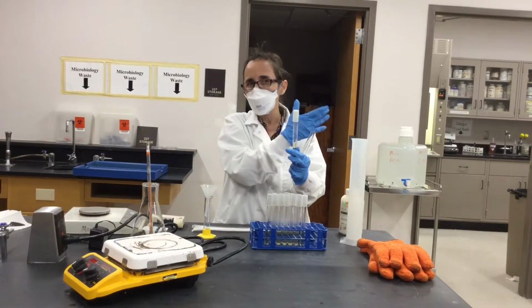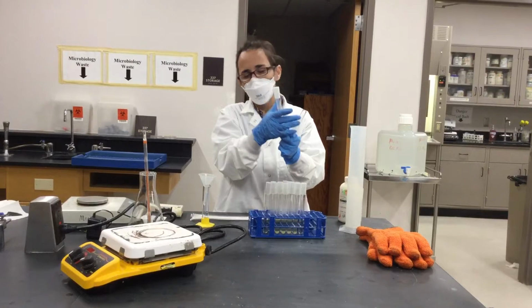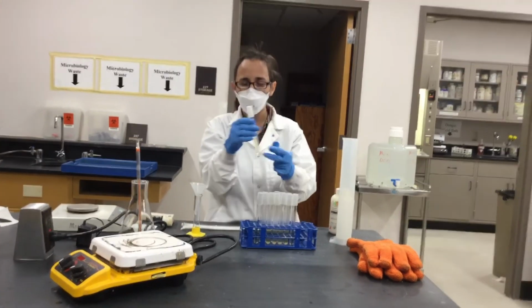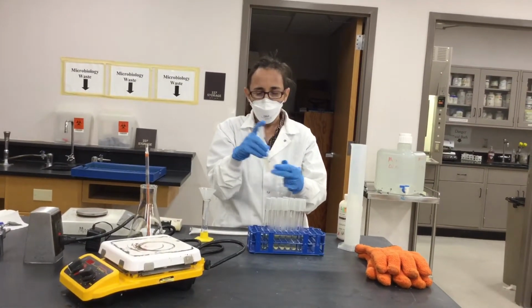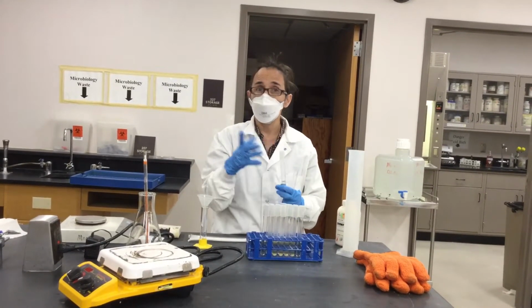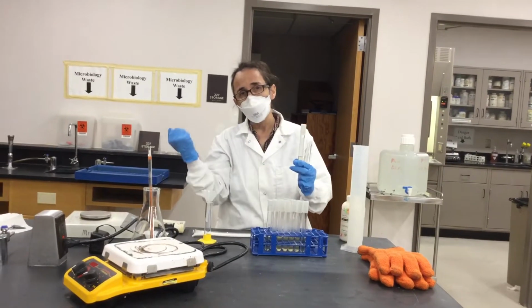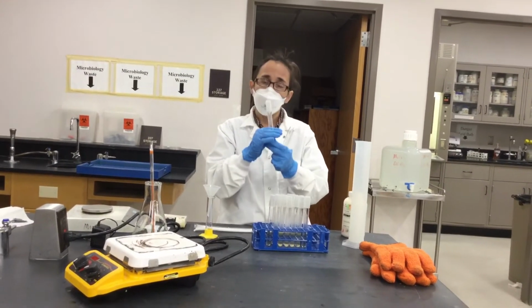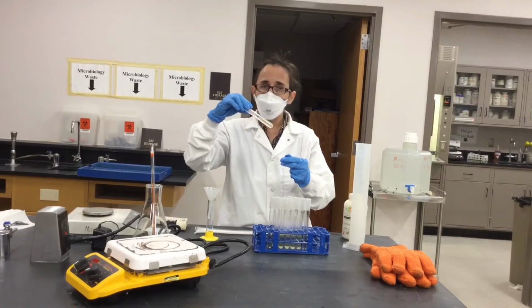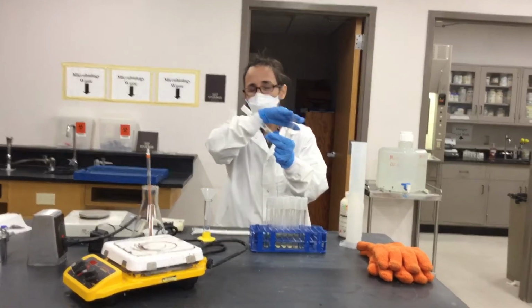So once we put it in the autoclave, it's going to, of course, liquefy, and it will be in the autoclave for 15 minutes, 121 degrees Celsius at a pressure of 15 psi. That will liquefy. So when you take it out of the autoclave, it will be liquid again, and then you put it on the tube holder that makes the slant, and you have a slant.